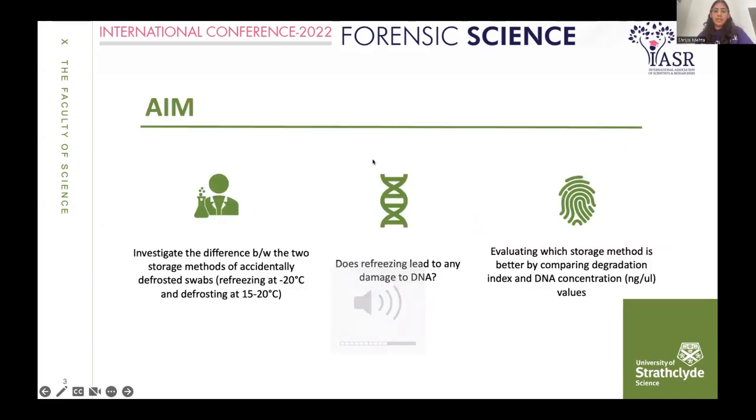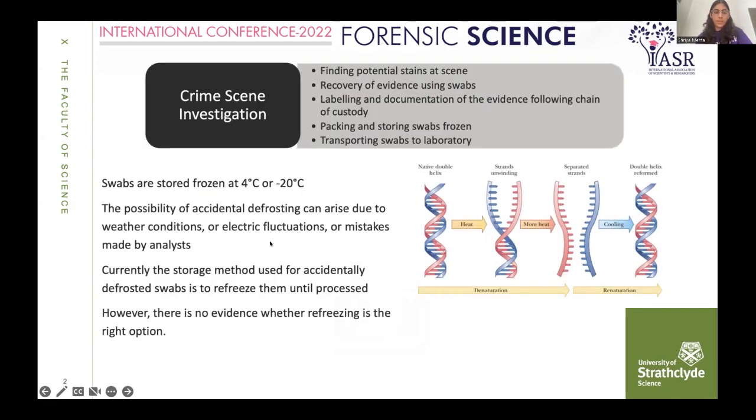Swabs are then transported to the laboratory. During this transportation, there lies a possibility of accidental defrosting. Accidental defrosting is simply the heat around the swab which, as shown in the figure, can lead to unwinding of strands or denaturation.